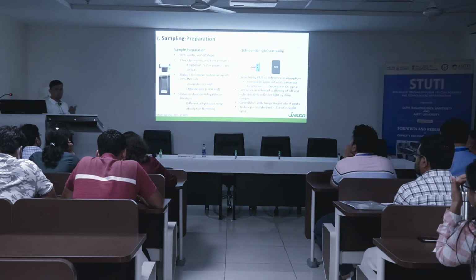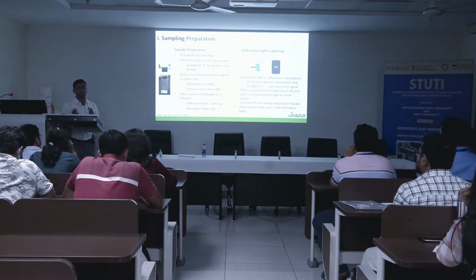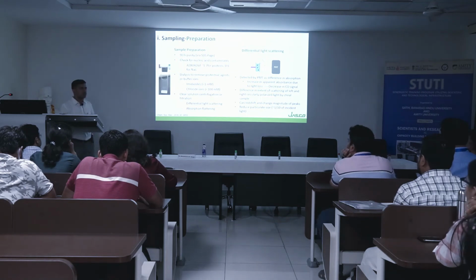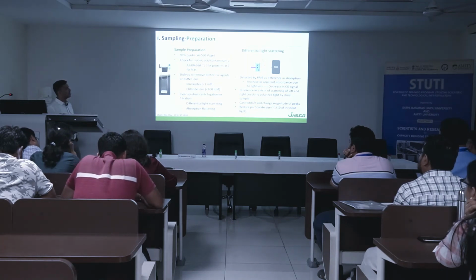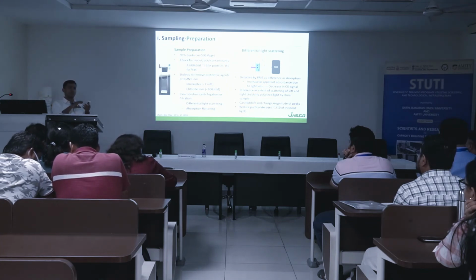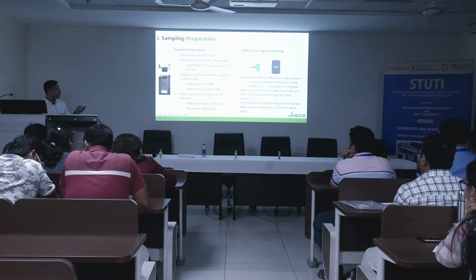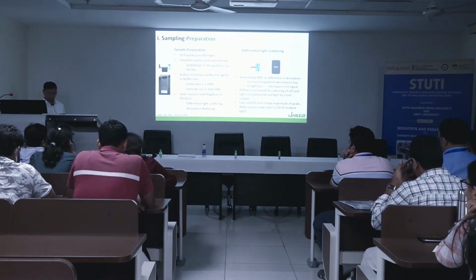So clear solutions are a must. It should not settle. Whatever solvent you use is very much important. Your protein should be soluble in that particular solvent. The solubility is very much important. When it's soluble, then you can get a good analysis. It should not precipitate, otherwise many things get diffracted and you won't get good results. This scattering generally happens if your protein is not very stable. They form clusters, sometimes they aggregate, and sometimes they get precipitated. This has to be considered. Whenever your sample is there, it should not be foggy. Such a sample is not good. It should be clear enough to get analyzed.